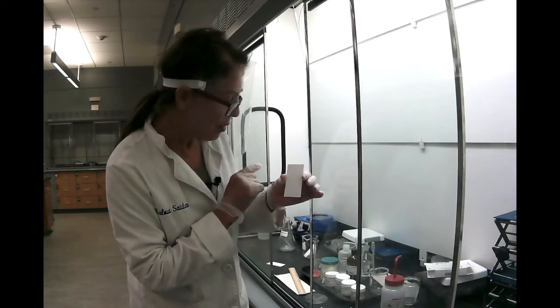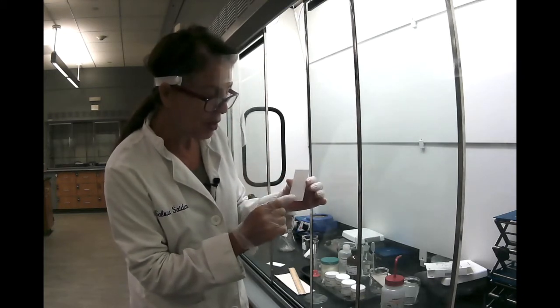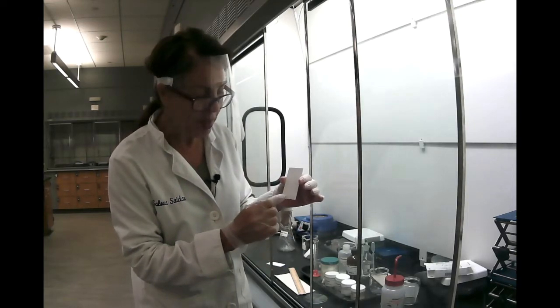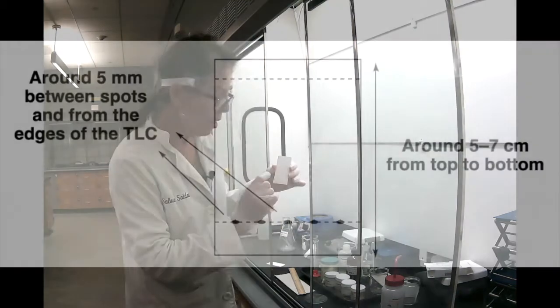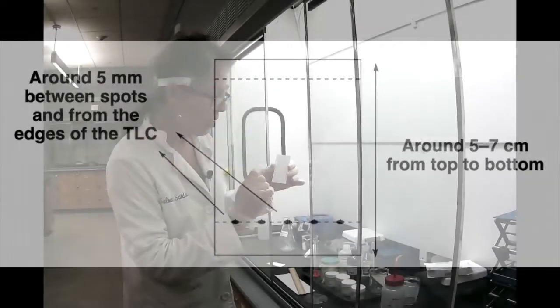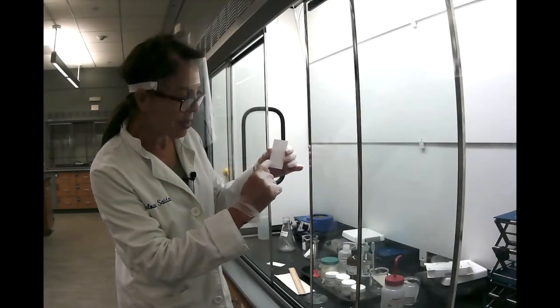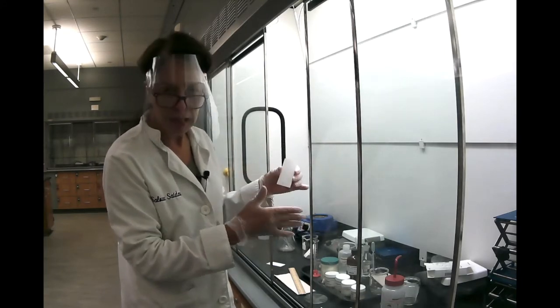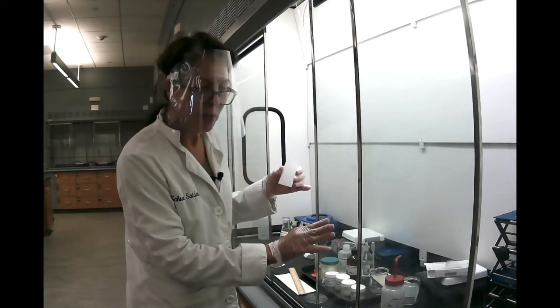So here we have 5 knowns, and I put 1, 2, 3, it should be 4 or 5. We have 5 known substances and an unknown substance that I put an X on. So what am I going to do now? I'm going to spot each of the substances on this plate, and then we're going to put it in a jar where we're going to develop it with the liquid phase.